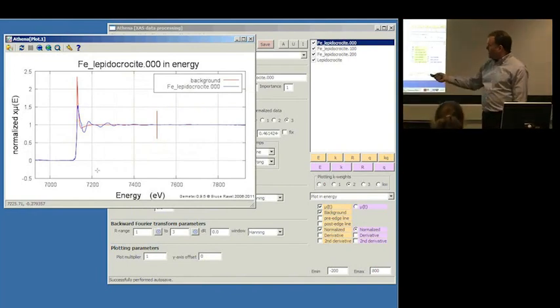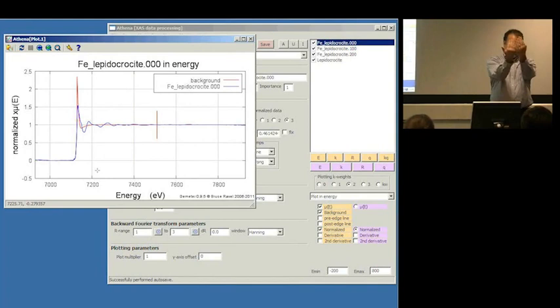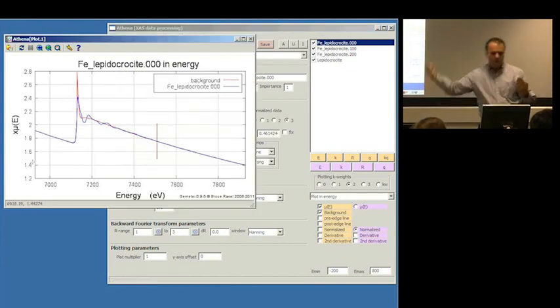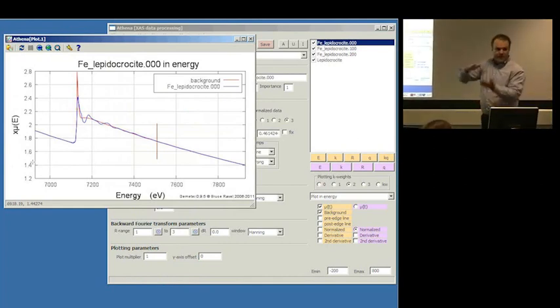That gets rid of the effect of thickness. When I talked about measuring the sample on this many layers of tape versus this many layers of tape, those would end up with mu plots like this that would look different. They would be different places up and down in a different edge step, because one of them is like this and one of them is like this.